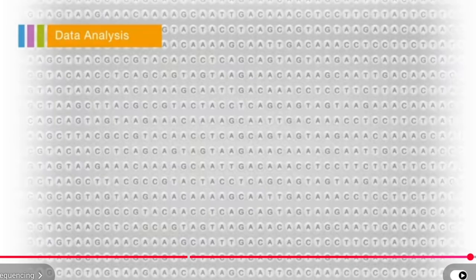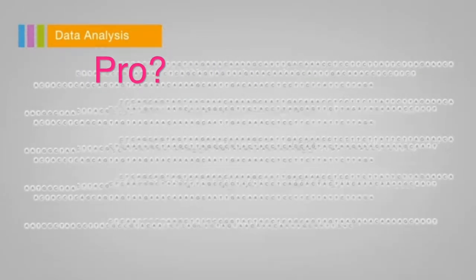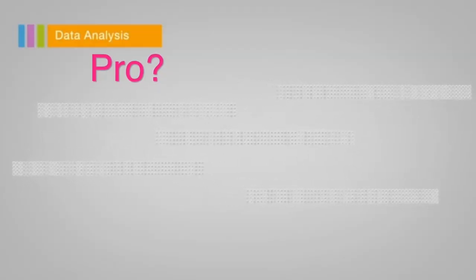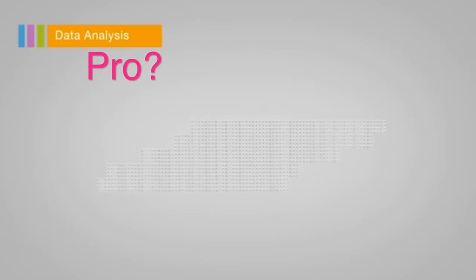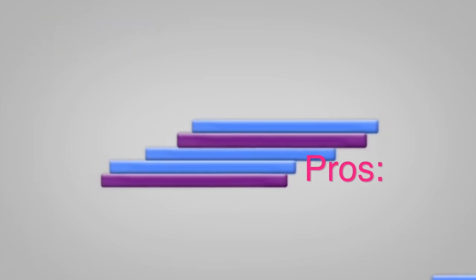Can you think of the advantage of this approach where you basically just fragmented all the RNA, read it, then aligned it back to the transcriptome, what the initial expressed genome would have looked like? Can you think of the advantage? There are several, and what I can think of is that one of the first ones is that all transcripts that are expressed in your organism are analyzed.